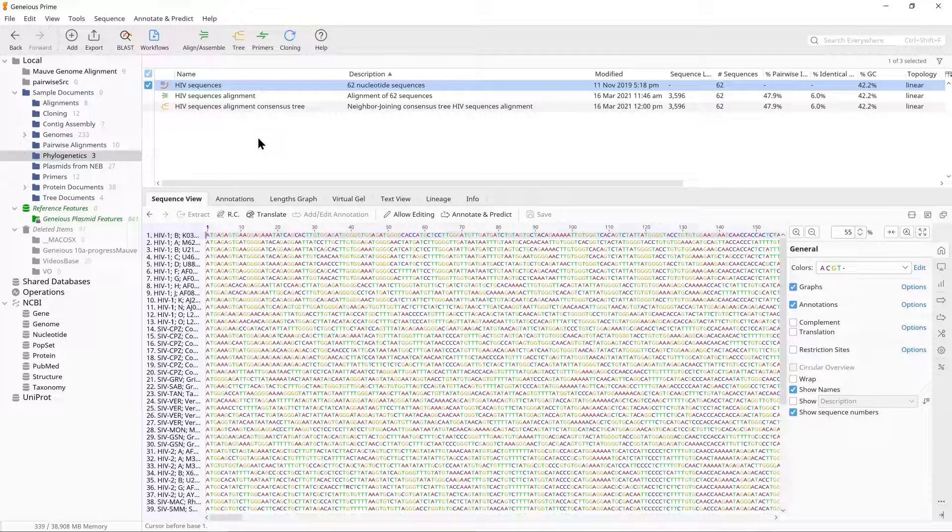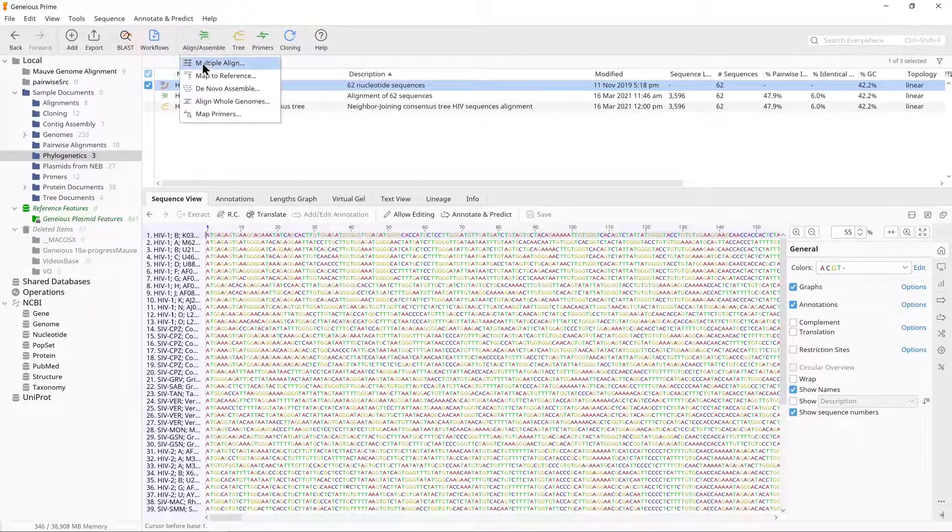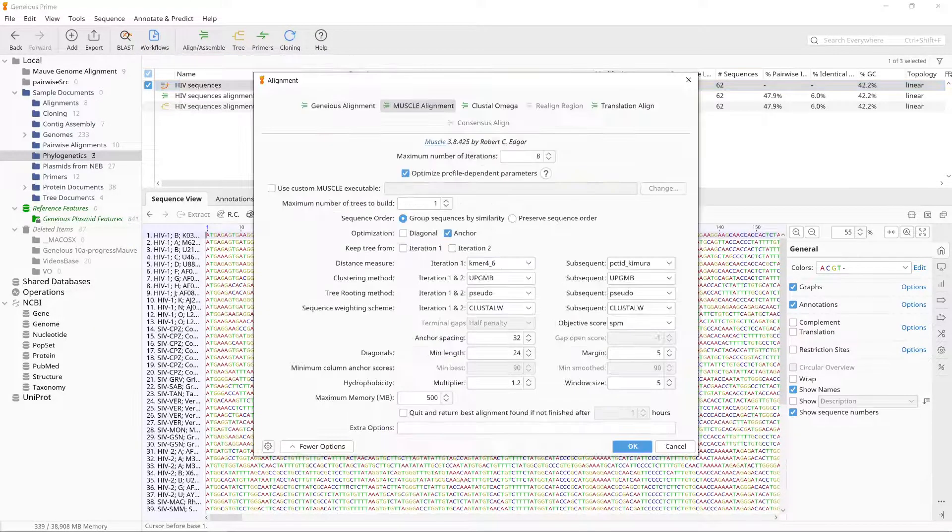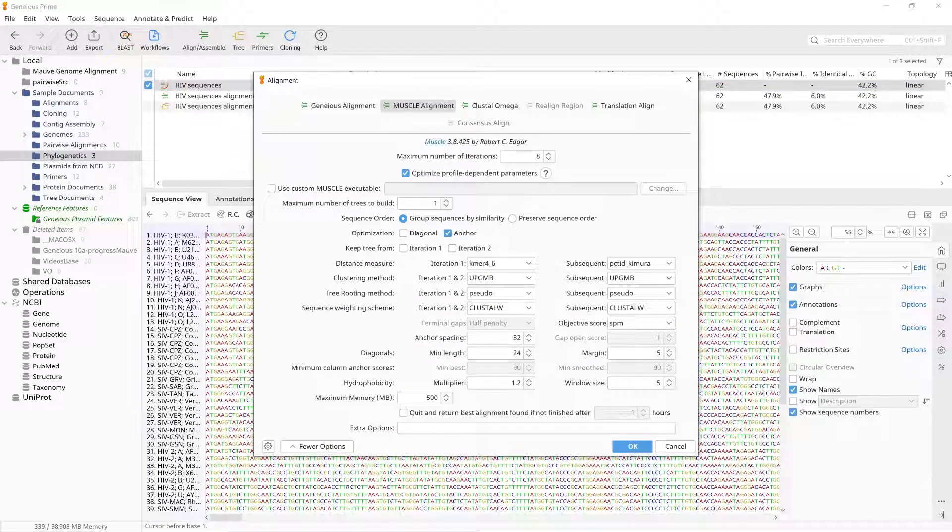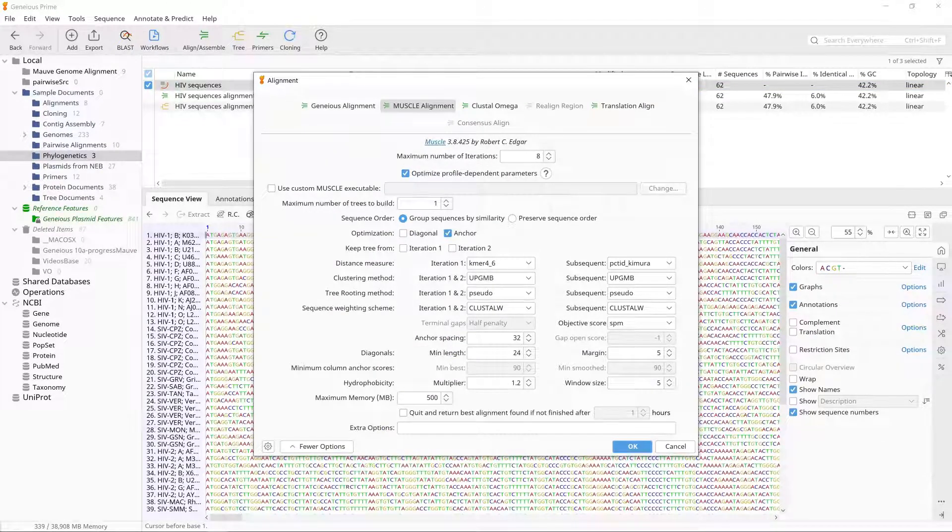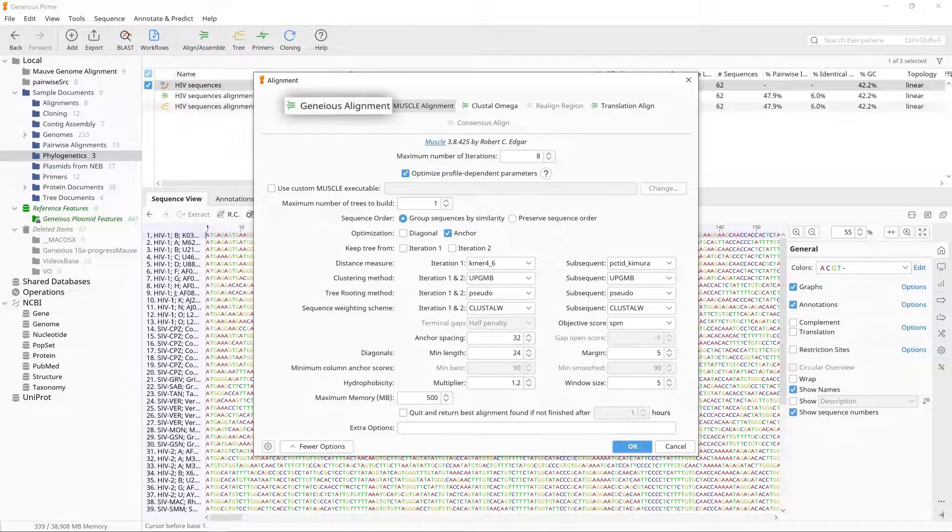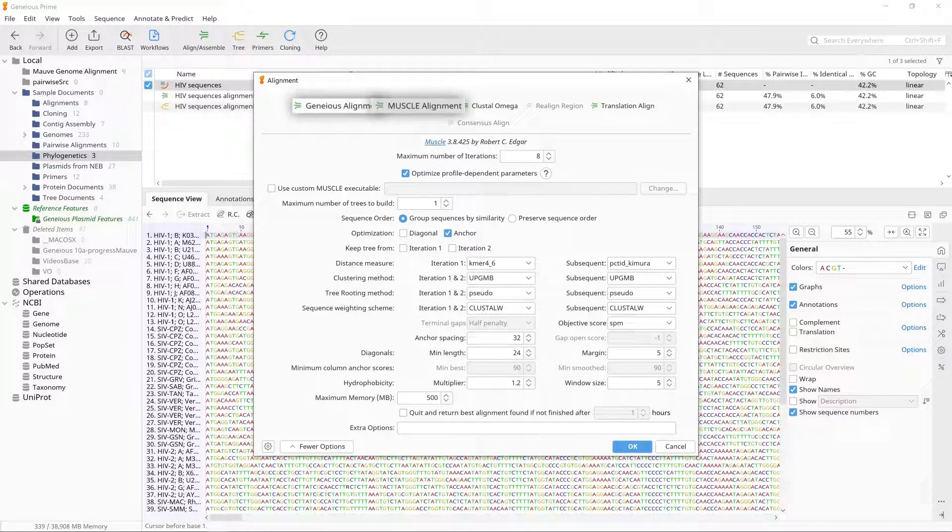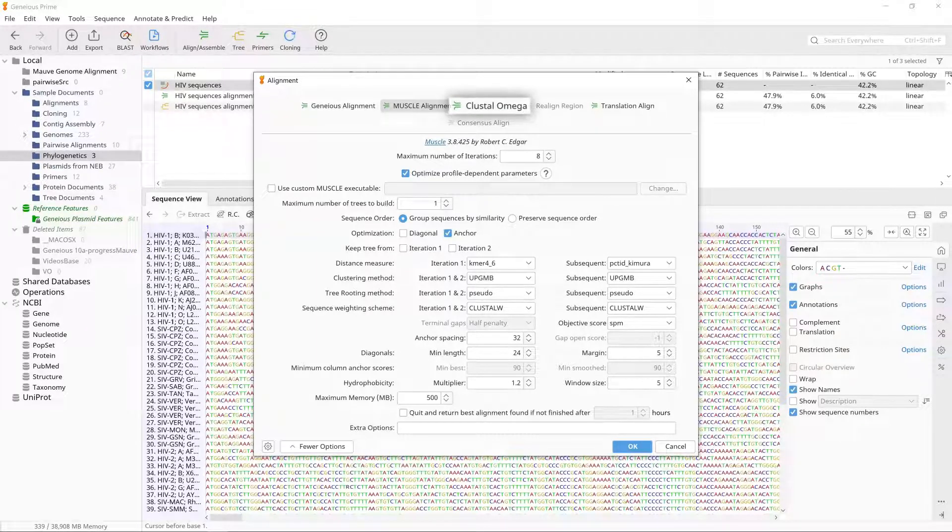To align a set of sequences, go to Align, Assemble, and Multiple Align. Geneious has three different alignment programs built in: the Geneious Aligner, Muscle, and Clustal Omega, and a free plugin for the MAFT Aligner is also available.